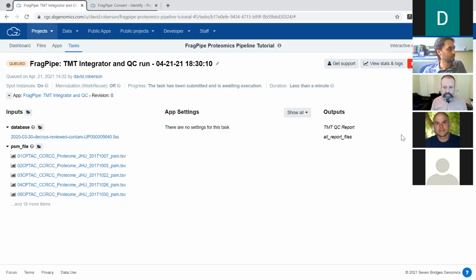And you'll see the report outputs on the right side when it finishes. I think this is about 30 minutes to finish this one. It'll include an HTML file that you can just open up right on the platform. So in the public project, we'll already have that there for you to see. But let's go ahead and launch into our studio.